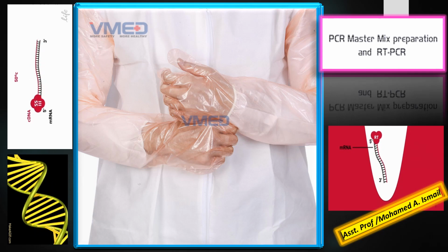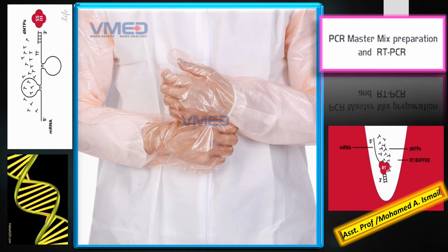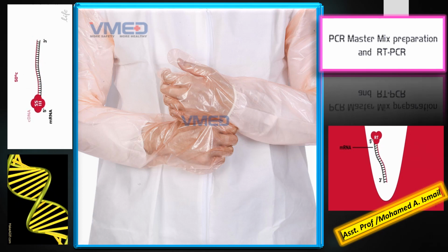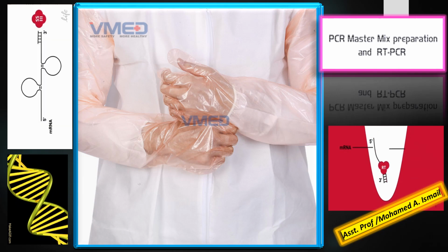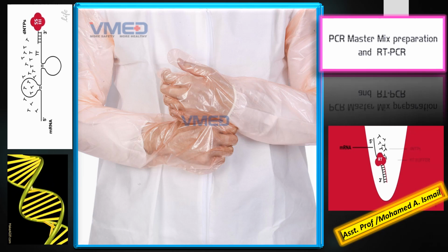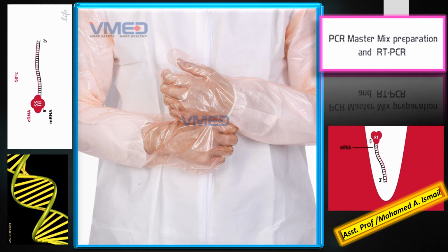PCR master mix preparation and RT-PCR, reverse transcription PCR. Preparation of the PCR master mix is a crucial part of molecular diagnostics, and it should be done in a dedicated room with dedicated equipment. Use clean disposable sleeves and gloves to avoid any risk of contamination, especially with DNA or RNA samples.